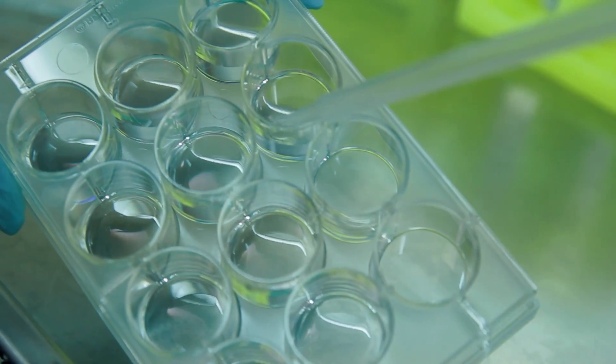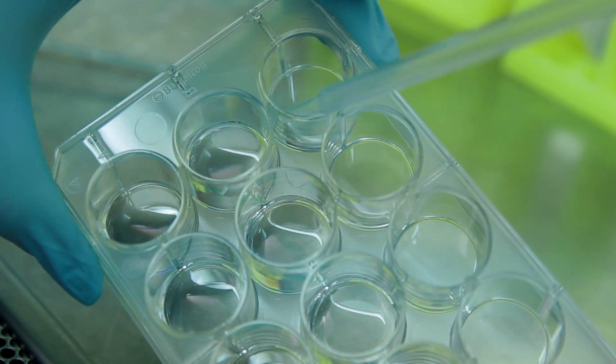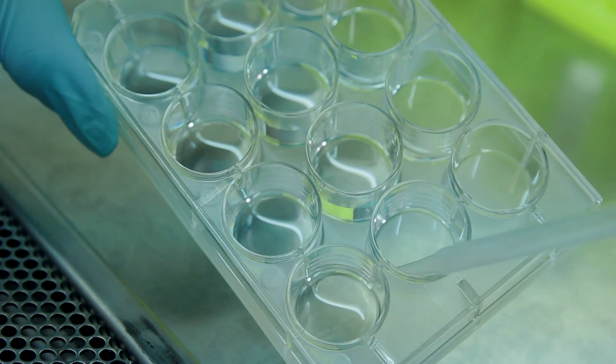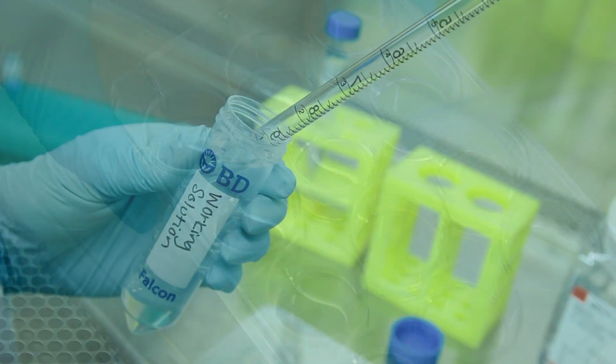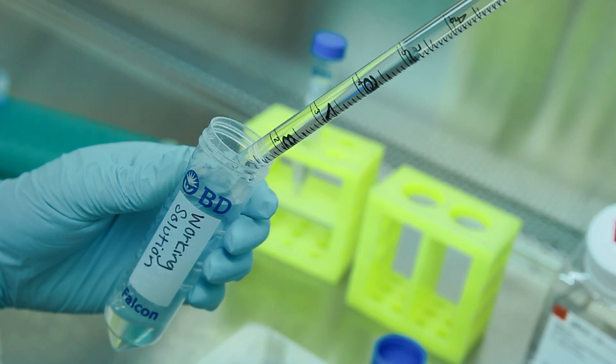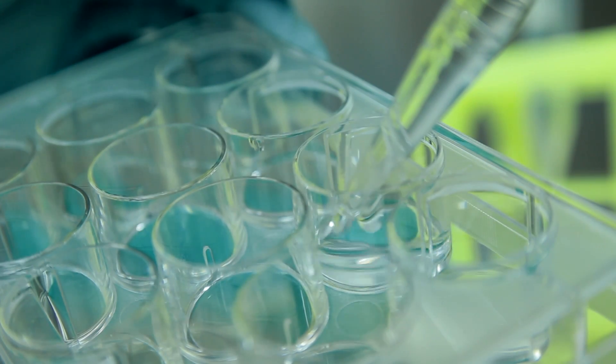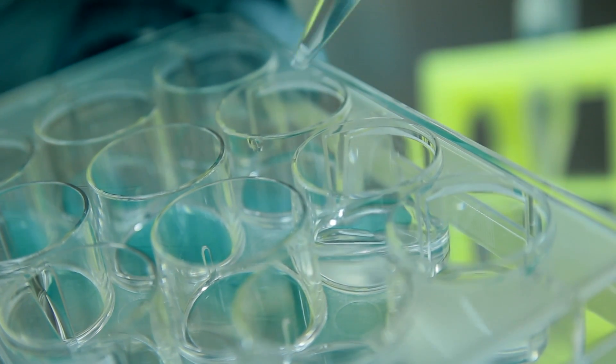Next, grab your sample plate and aspirate the PBS buffer from each well. Then, add 2 ml of the working solution, making sure there's enough volume to cover the bottom of each well.